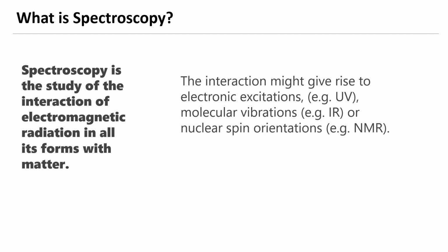unable to say which type of molecule is present in that test tube and how much of that molecule is present, because we cannot measure that particular color. If we carry out a reaction between two chemicals A and B, and it produces a product C, which is a colored product, say it produces a yellow color.